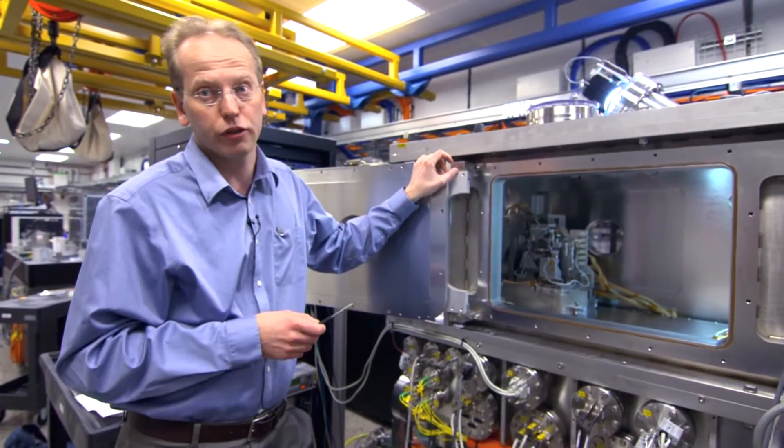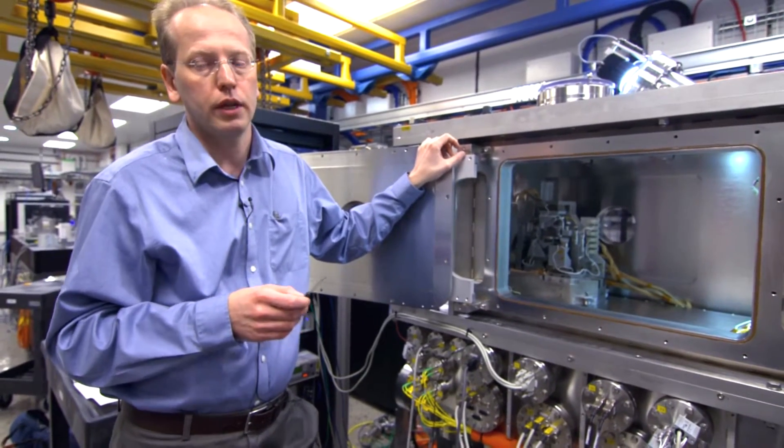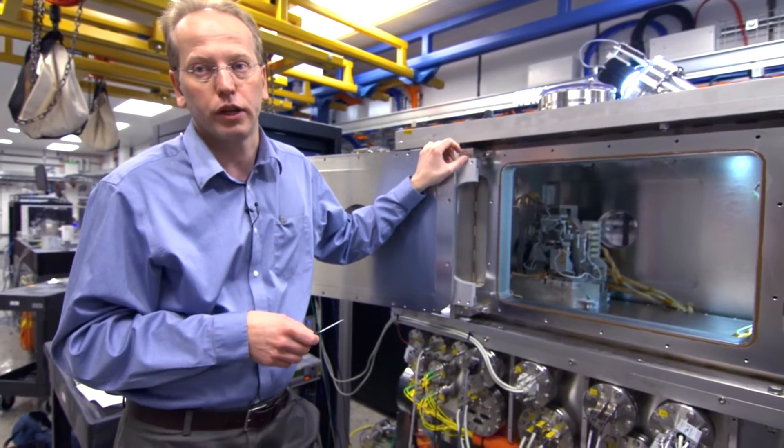So this is really a challenging task. And we have to control this stability and resolution for hours. This is duration of the measurements.